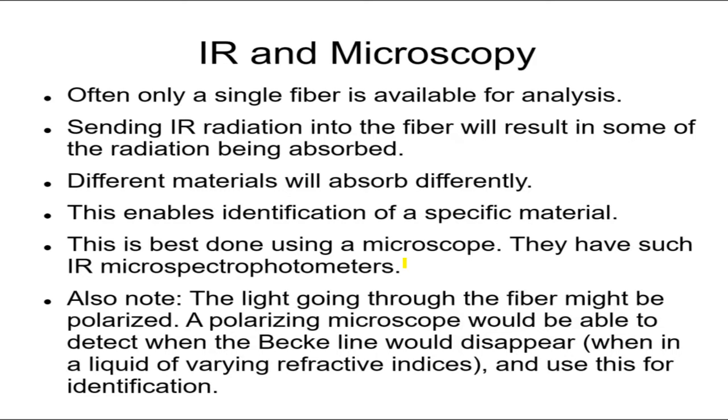So even if you don't have a suspect, for example, what you can do is take the fiber from the crime scene, if you know it comes from the perpetrator. Let's say the victim doesn't have any red shirts, he only has white and blue, and you find red fibers there. So this must have come from the perpetrator. So you look at this under the IR microspectrophotometer, and you get exactly the chemical used in the dye. So you find out who's selling shirts with this kind of dye, and where these shirts went, and you can narrow down your suspects this way.